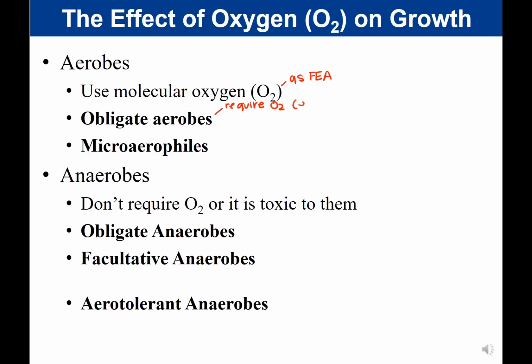And an example of this would be Pseudomonas aeruginosa.